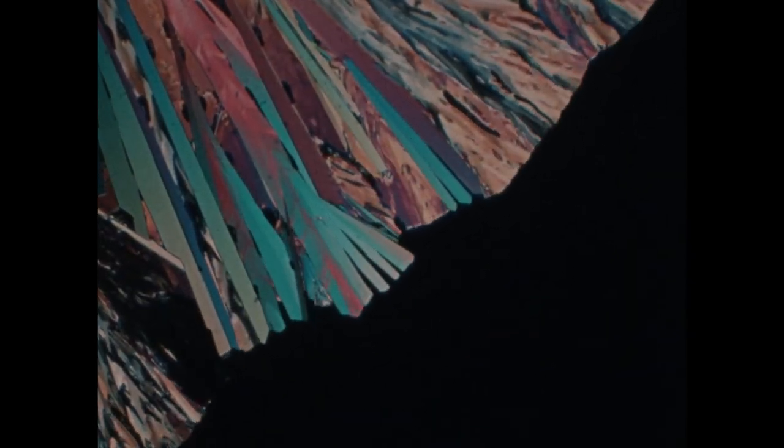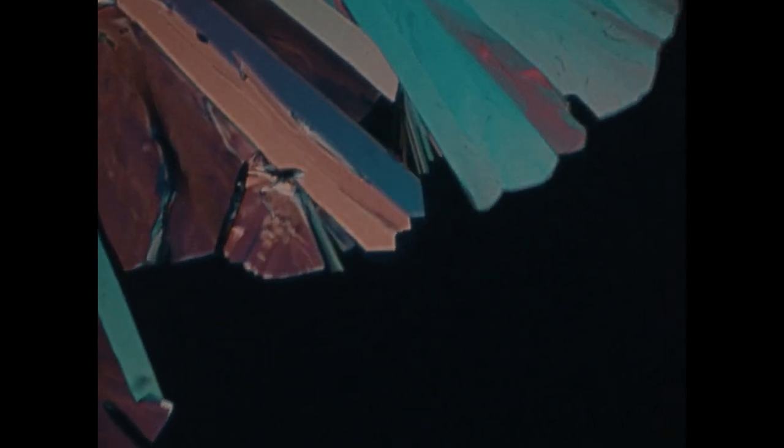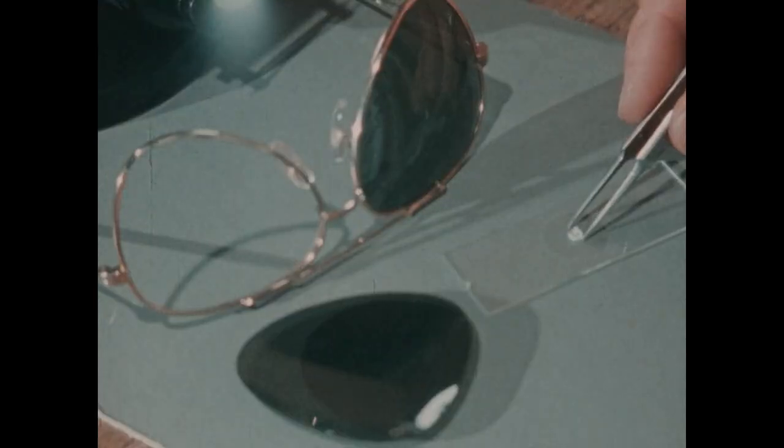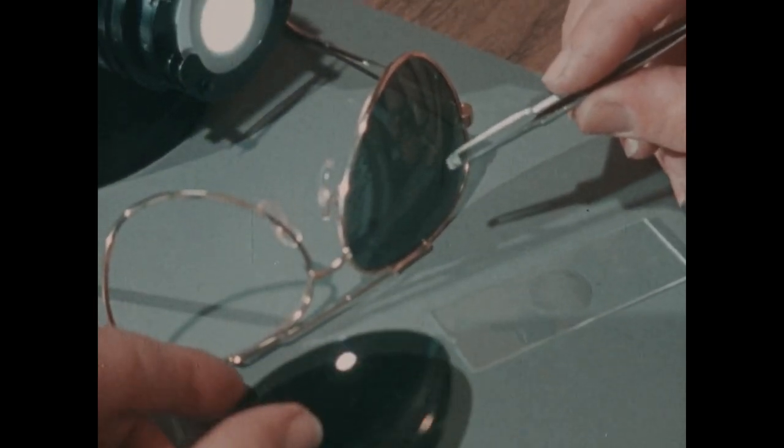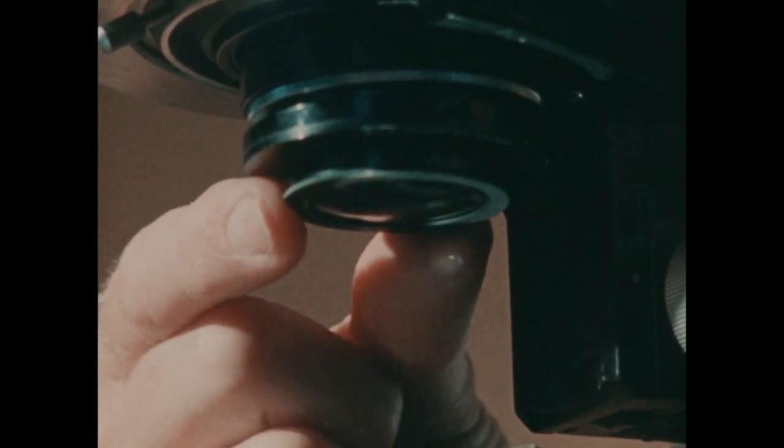Another way to manipulate color is to use polarized light. These changing colors give information about the composition and thickness of growing crystals. But these effects are only visible when crystals are viewed between crossed polarizers. In this case, lenses from a pair of sunglasses. Here is the principle. Rotate the polarizing lenses until they cross, extinguishing the light. Now the crystal shows up in colors not seen in normal light. Fit your microscope with polarizers and explore a world of light and color.